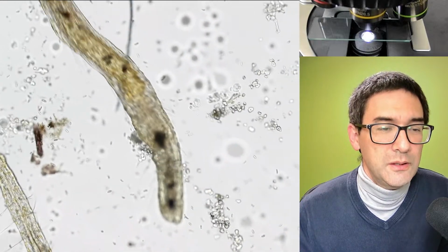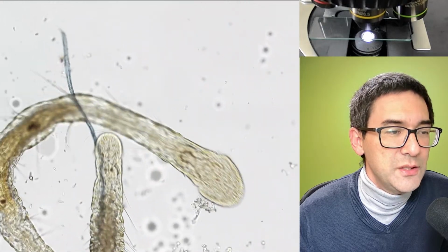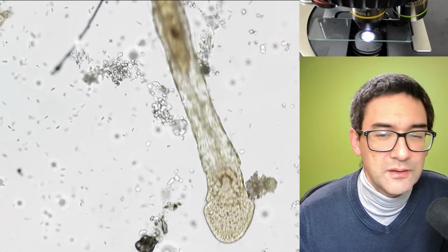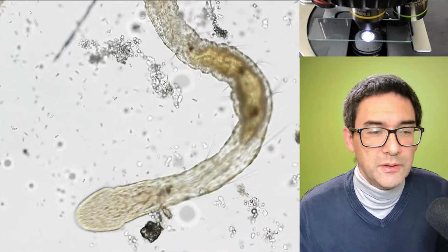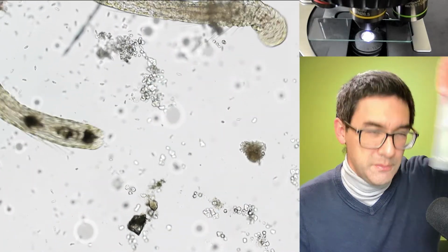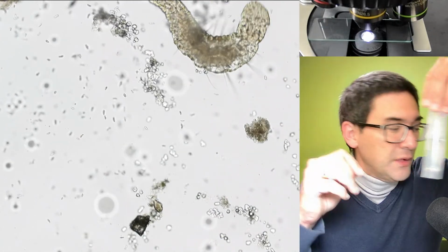So yeah, you see, nothing happens very much, but actually, because you can see those round oil globules in the liquid, it actually means that there must be some of the substance present. So you know what? As we look at this here, maybe what I could try is, I'm also checking, I have 15 minutes, maybe more. I'm checking if there are some other organisms in here. There are plenty of worms. Maybe some in the sediment down there. I don't know.